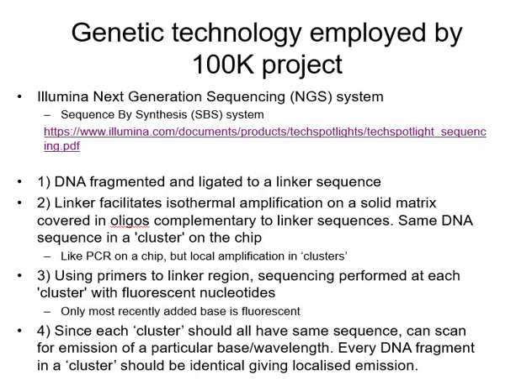Okay, this part of the lecture is going to cover specifically the Illumina next generation sequencing technology, which is called sequence by synthesis, and this is really quite complicated. I'll take you through it bit by bit, but I'll also discuss it in the live session.